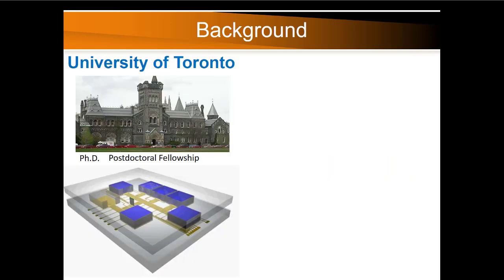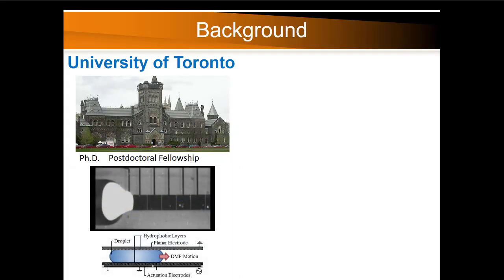After that, I went to the University of Toronto, where I started my PhD and then did my postdoc as well. What I was interested in there were digital microfluidic devices. Basically, we use electric fields to move droplets around on these checkerboards. We have a checkerboard of electrodes, with no channels, pumps, or valves, but we can move droplets around. I don't have a scale bar here, but these electrodes can serve as your scale bar, and they're typically on the order of 1 millimeter by 1 millimeter.